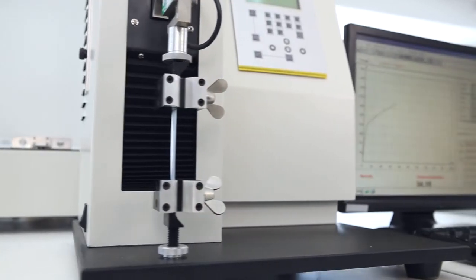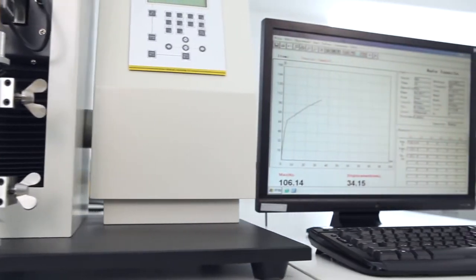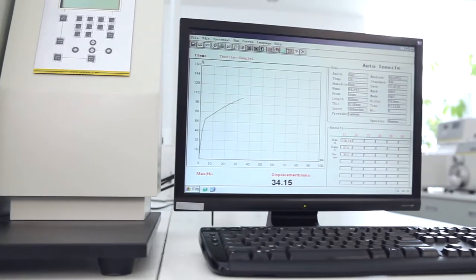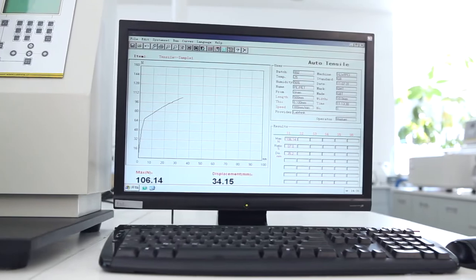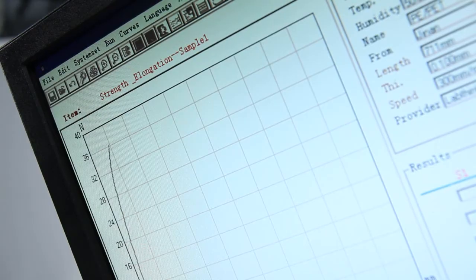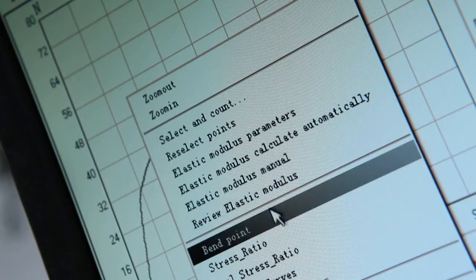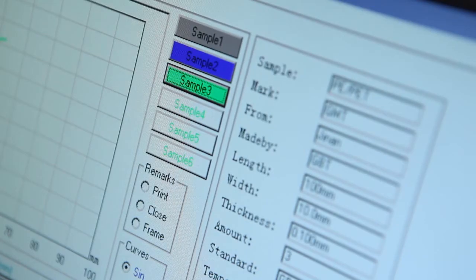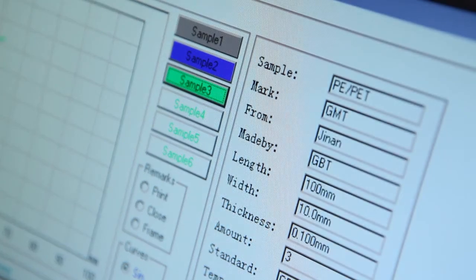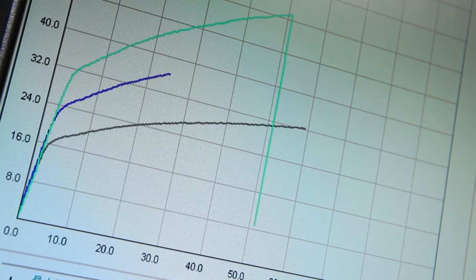The testing software designed by LabThink has an intuitive operation interface, visual display of real-time data and graphs. It can calculate the tensile stress at a given elongation, elastic modulus and stress strain, and carry out historical data comparison and curved superposition analysis.